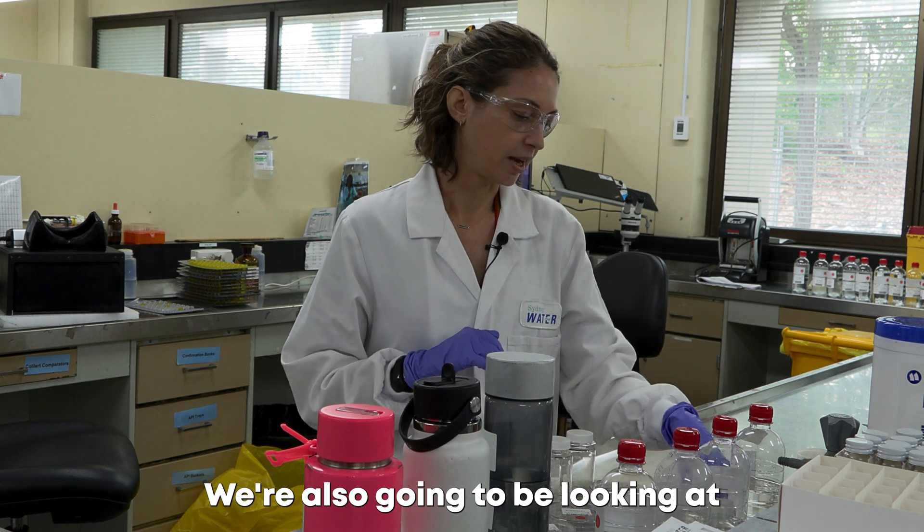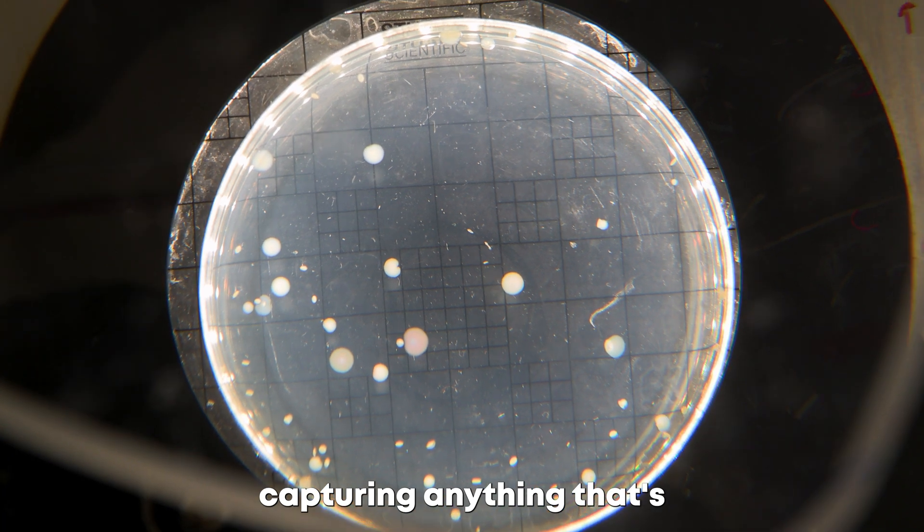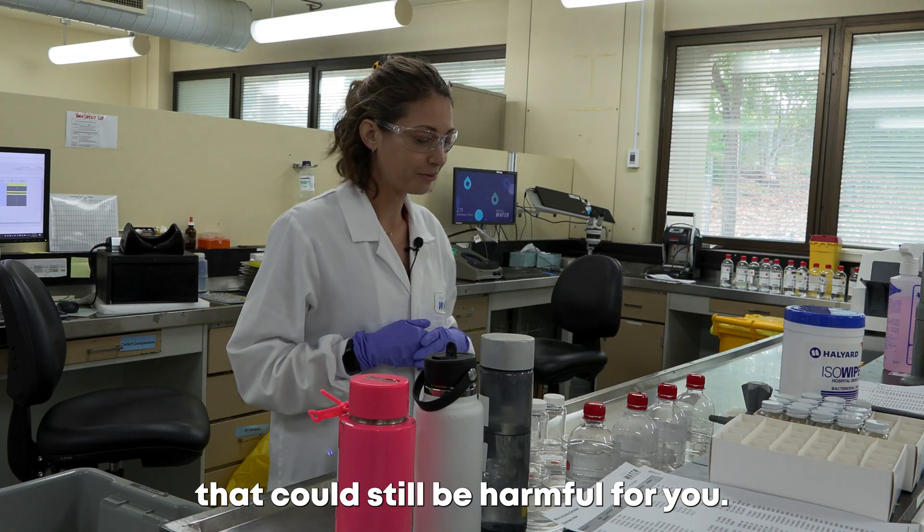We're also going to be looking at heterotrophic plate count, which captures a broad range of bacteria — anything that's perhaps not a total coliform but could still be harmful for you.